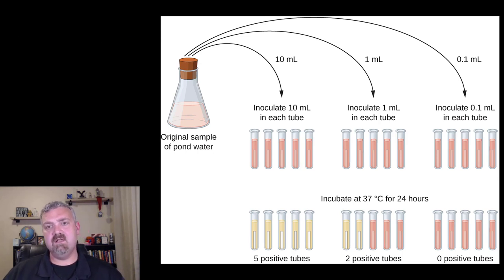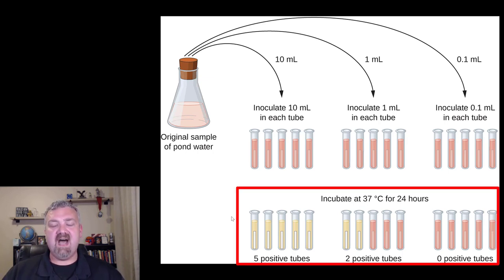Then we come back in a day and we're looking for these color changes. You'll see here with this original sample, five of the five 10-milliliter tubes were positive and turned yellow. Two of the one-milliliter tubes were positive and turned yellow, and zero of the 0.1-milliliter tubes were positive.